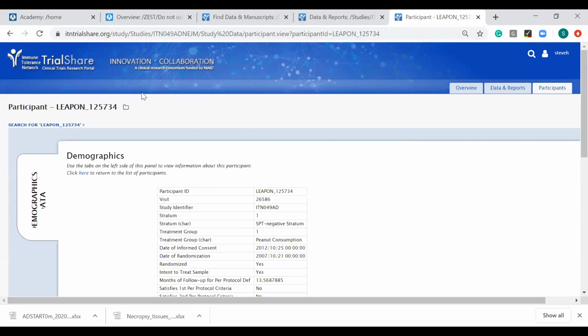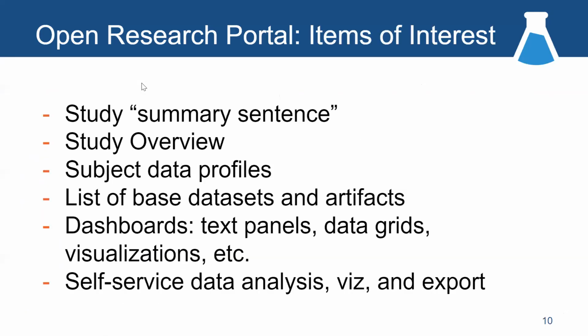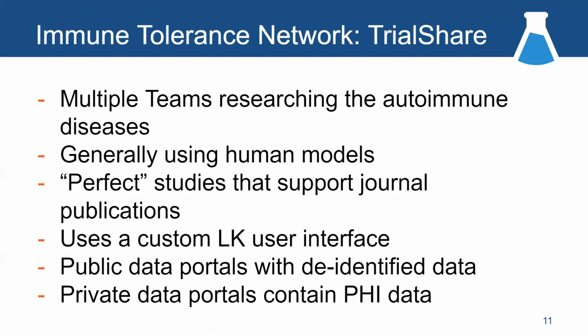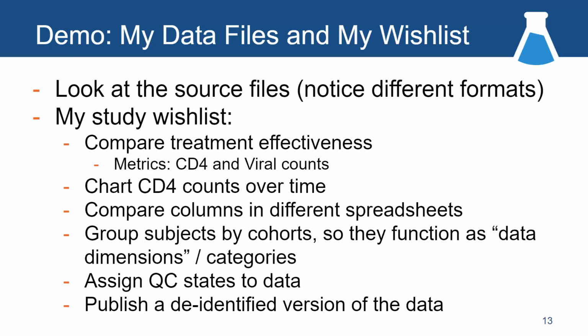Okay, great. Well, let's keep going here. These slides, I'm going to make available to you. But I think let's actually build something. How did those two teams or those two sites get put together? Really the rest of this presentation is a practicum about how to work with the study features.